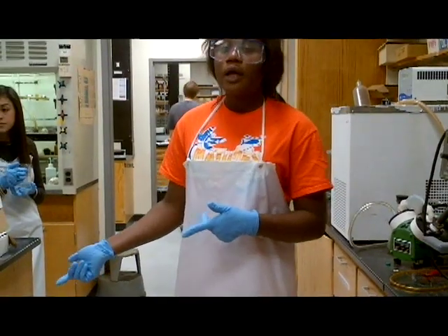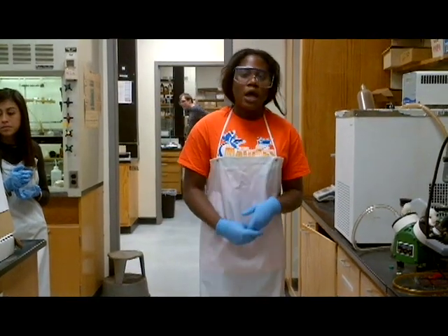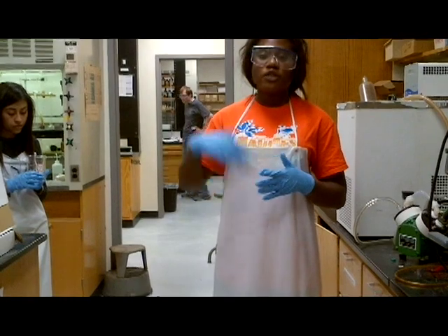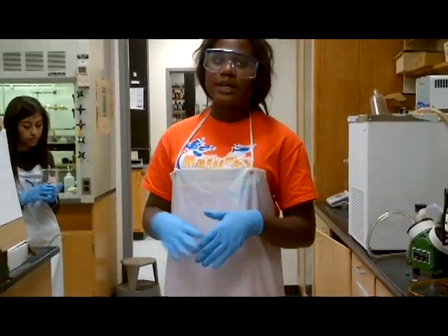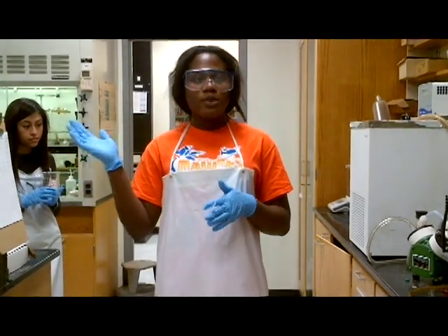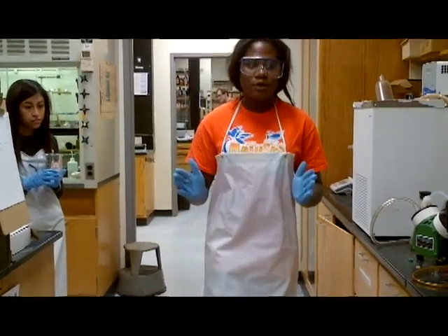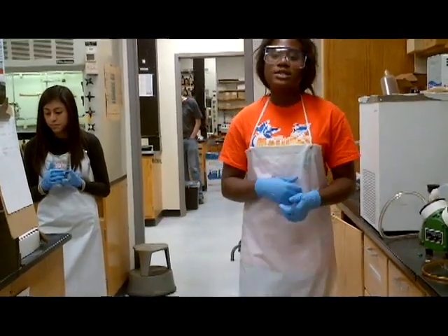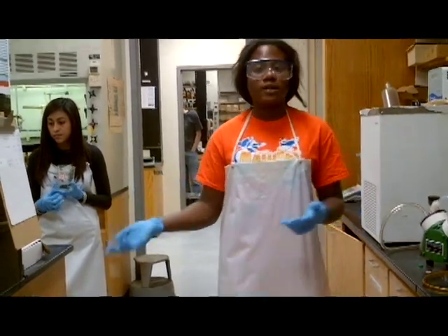For this lab, the two main wastes that we have right now are halogenated and non-halogenated. Non-halogenated waste is usually disposed of through burning, and just goes into the atmosphere. But halogenated waste, if it is burnt, can harm the ozone layer. So it's very important that these two are kept separate. And also, different chemical substances that shouldn't be mixed together can lead to explosions or fumes that can be hazardous to everyone in the lab.